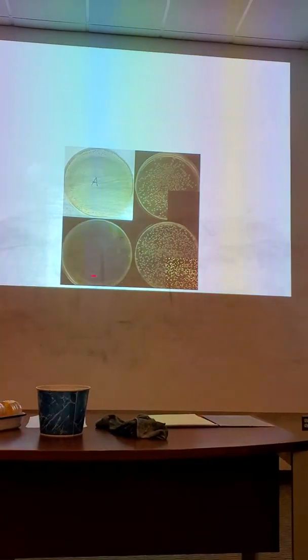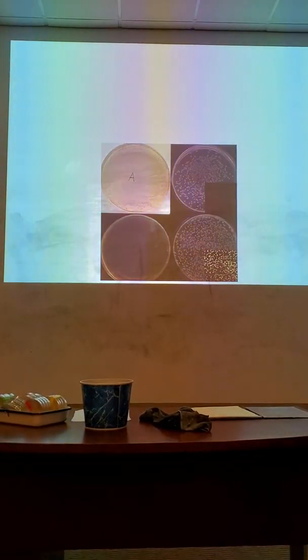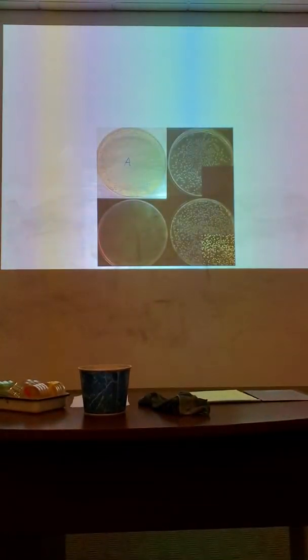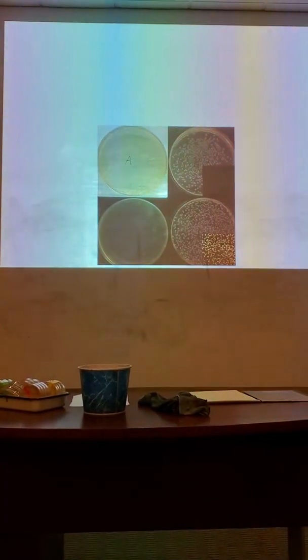This is the plate with no cells at all, as we would expect for E. coli that was not given any AMP resistance gene, again showing that the plates really did have sufficient ampicillin in them to kill. I didn't bring all the plates down, unfortunately, and not due to any fault of you guys.